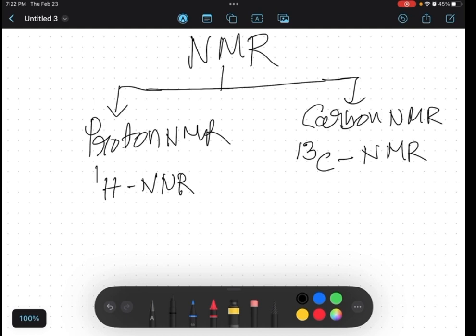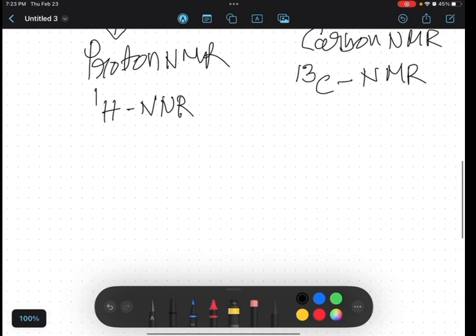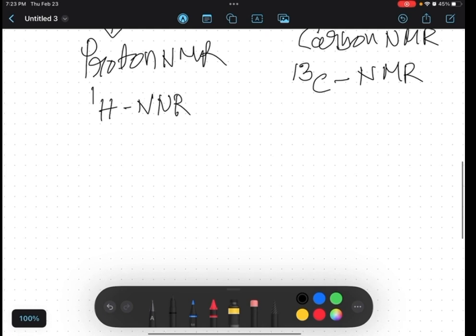The basic principle of proton NMR and carbon NMR almost everybody knows. If you don't know, just read a basic spectroscopic book and you will know. Here I'm going to show the application, how to read proton NMR and carbon NMR to determine the structure. Before doing that, I'm going to describe some basic information to read. The proton NMR is a spectrum or signal.